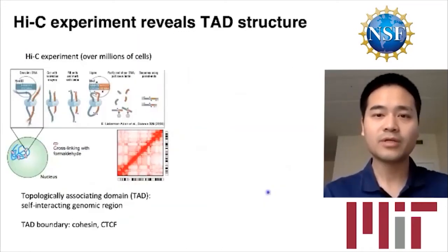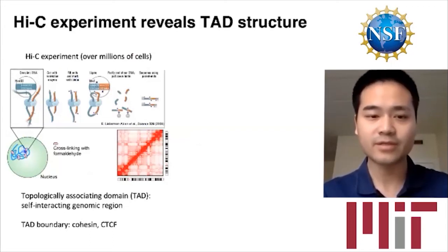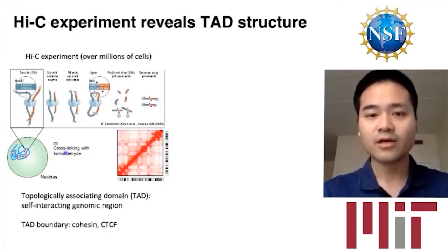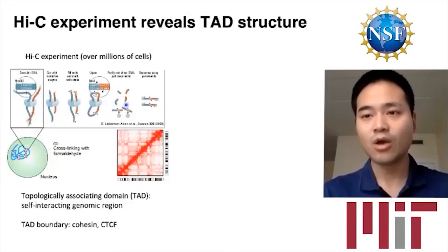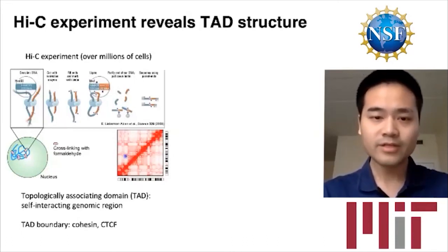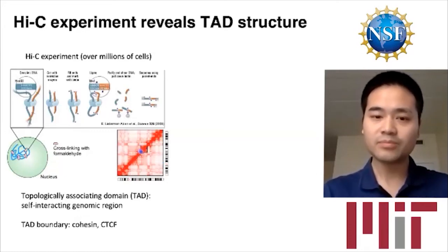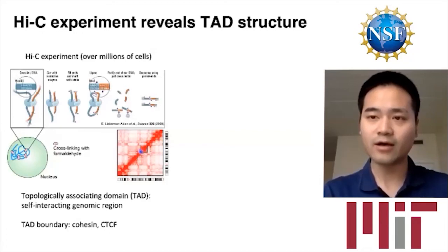And the Hi-C experiment has enjoyed great success in characterizing chromatin organization. So in this Hi-C experiment, the genomic regions close in space are cross-linked with formaldehyde. And in the following, the high throughput sequencing tells us which two genomic regions are close in space. And this is a Hi-C contact map for an entire chromosome. An obvious feature is the blocks along the diagonal line, which means the genomic regions within the block are contacting with each other.